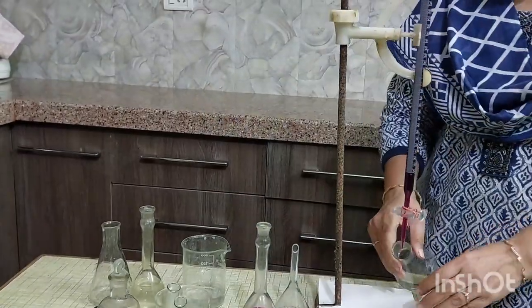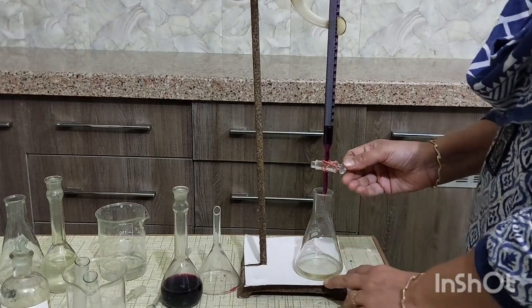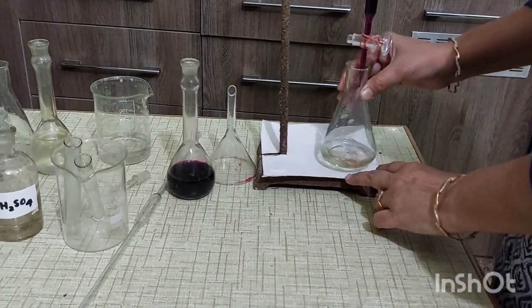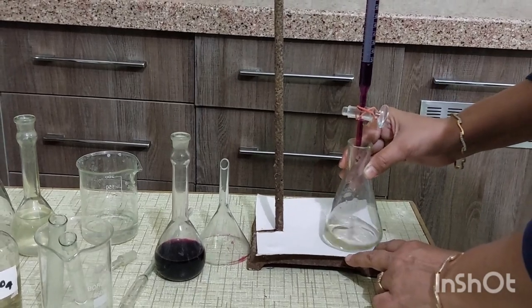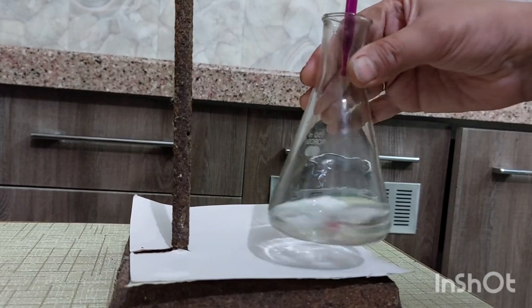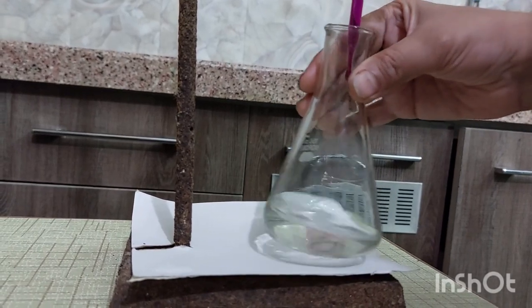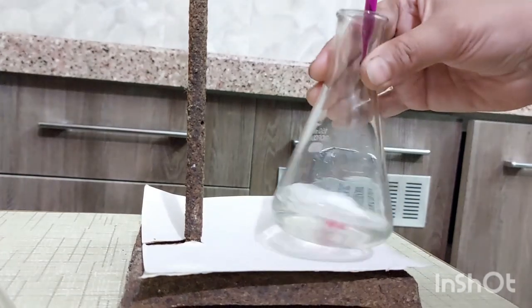And then titrate it with KMnO4 solution. KMnO4 is a self-indicator. When this transparent color changes into light pink color, that will be the end point of this titration.